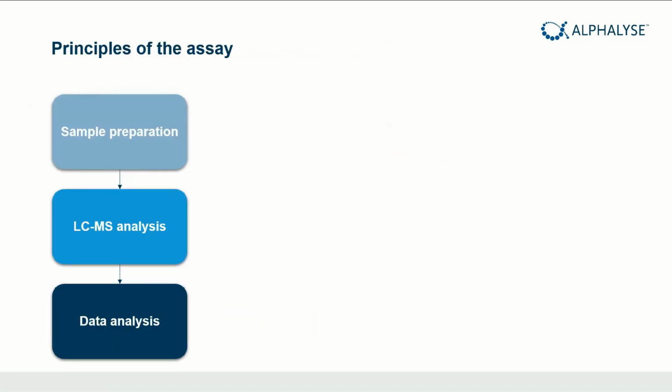The principle consists of 3 steps, you can say. The first part is sample preparation to digest the protein into peptides. The second step is the LCMS analysis, and the third step is the data analysis part.